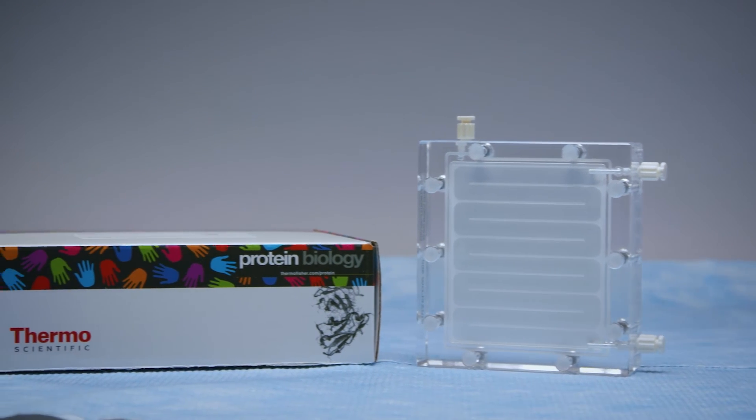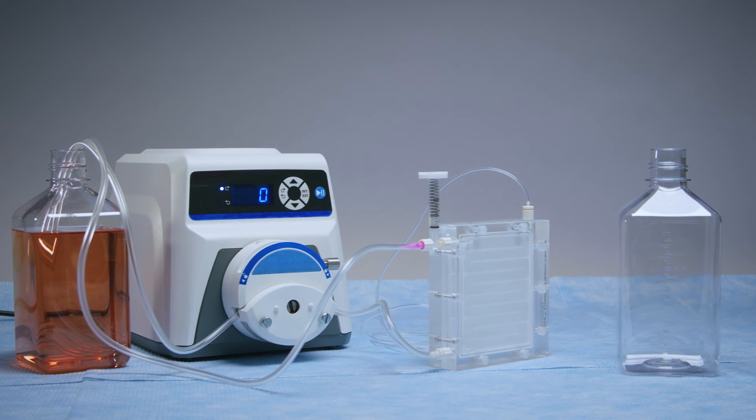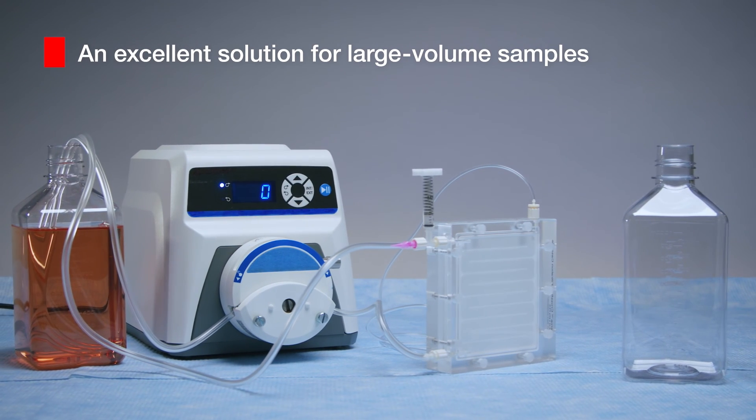So there you have it. The Pierce CrossFlow Filtration cassette is easy to use, fast, efficient, and an excellent solution for your large volume sample needs.